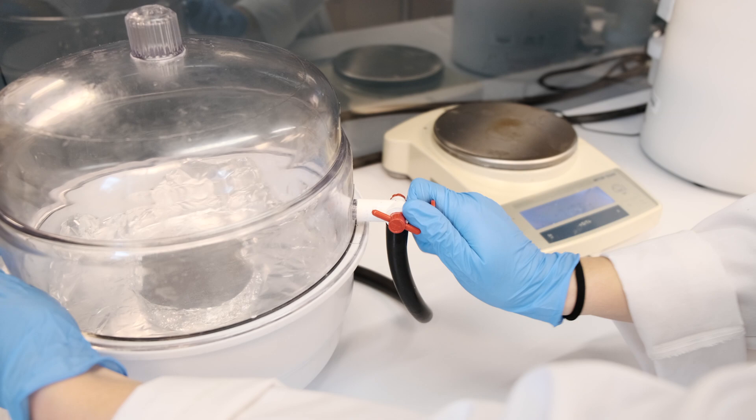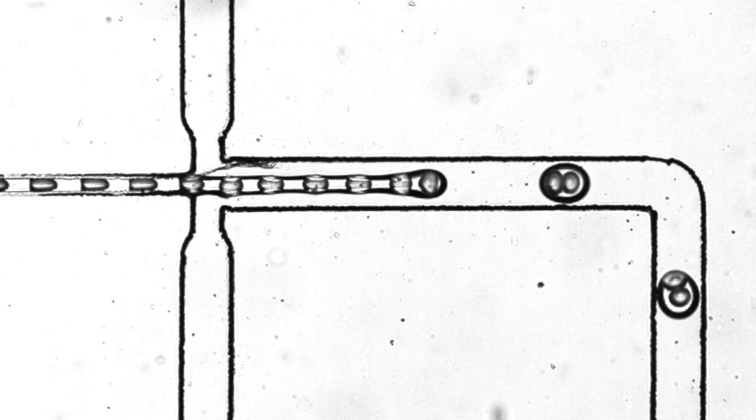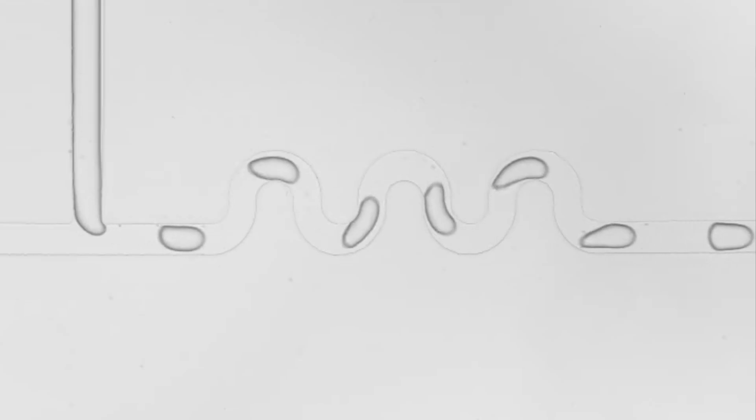One of the things that we do on our microfluidic chips is build droplets. Droplets are like any drop of water, a raindrop, that's a droplet, but we make these on a much smaller scale that you can only see under a microscope. We do that on a chip and at really high throughput, so that means thousands of these droplets per second.